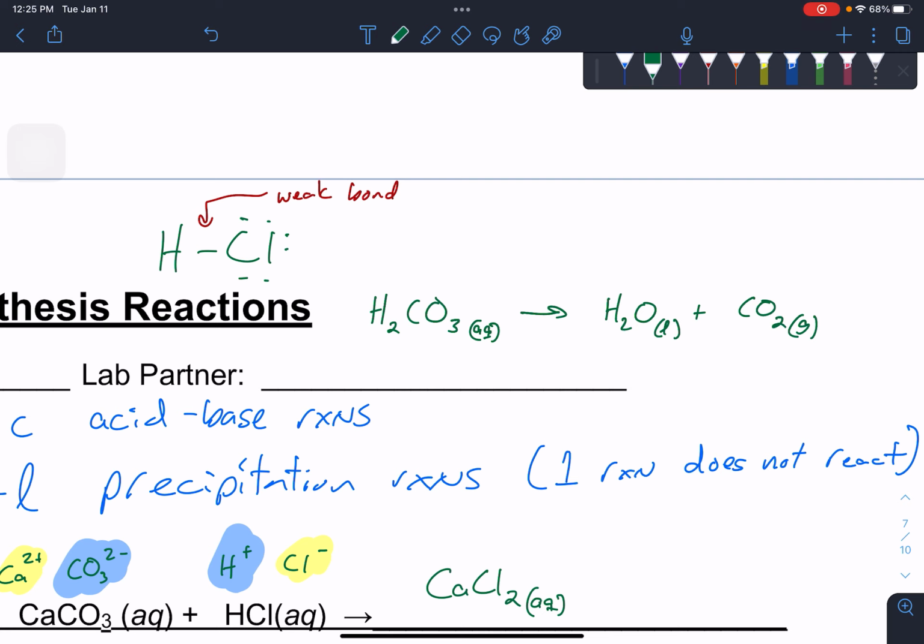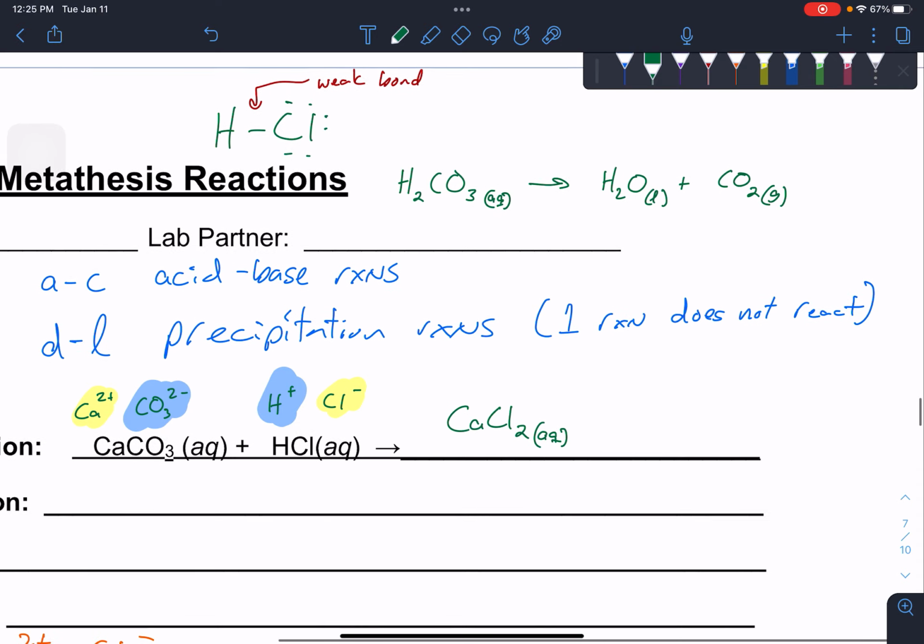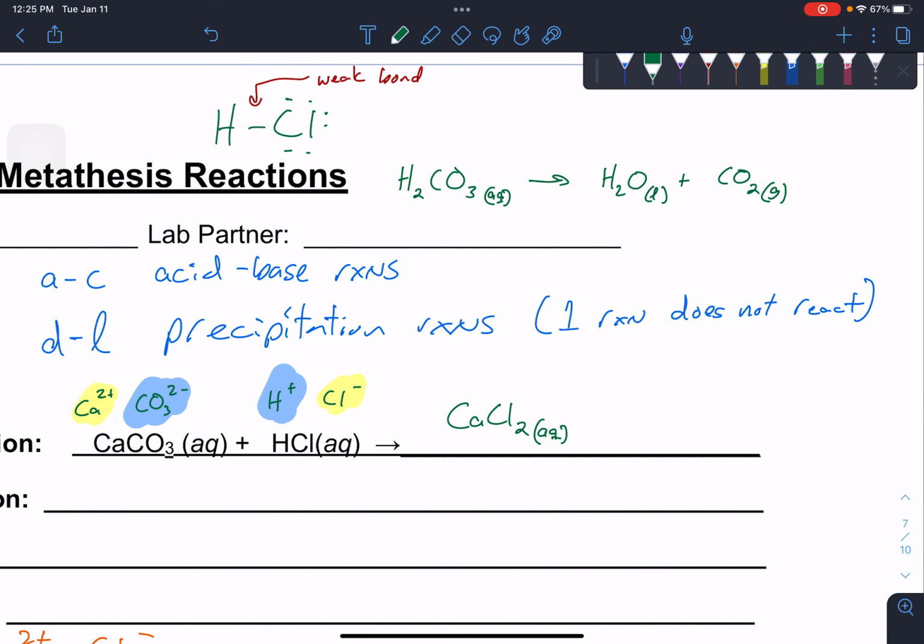Now, for the reaction that you're going to see, go ahead and do the reaction. I'm telling you what's going to happen. It's real simple. There won't be a lot of fizz. There'll be a few bubbles that pop up. The concentration of that calcium carbonate is not terribly high, even though it is a saturated solution, it's still not too high.